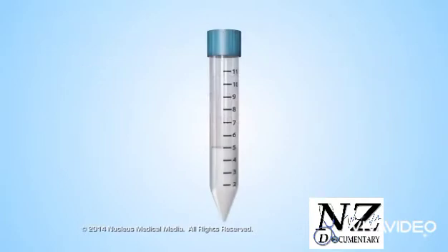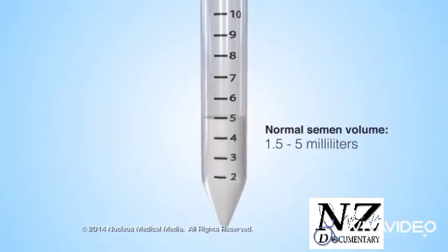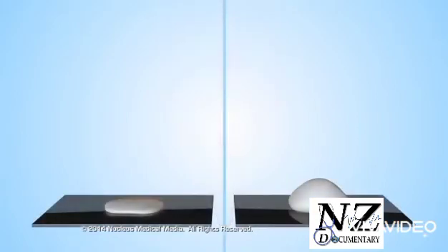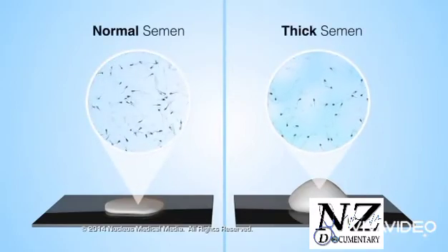In the lab, the person testing the semen will look at the total amount or volume of the semen sample. The normal volume ranges from 1.5 to 5 milliliters, or about a third of a teaspoon to 1 teaspoon. If the semen volume is too low, it may not have enough sperm or enough fluids to nourish and help transport the sperm to a woman's egg. The lab will also look at the thickness of the semen. If the semen is too thick, the sperm will be trapped within it.